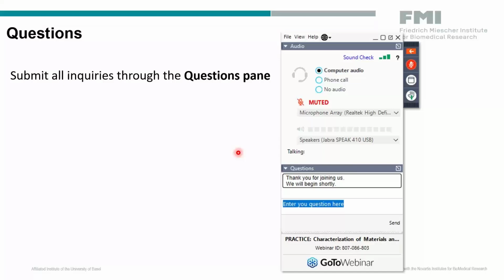Okay, thank you. What's the running time of the typical experiment, or maybe there isn't such a thing as a typical specimen, but what is the range of acquisition times that you run in your facility? For Connectomics, we need to reach at least, I would say, eight weeks.